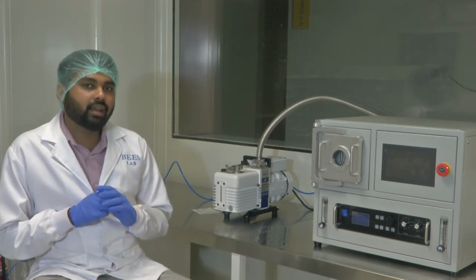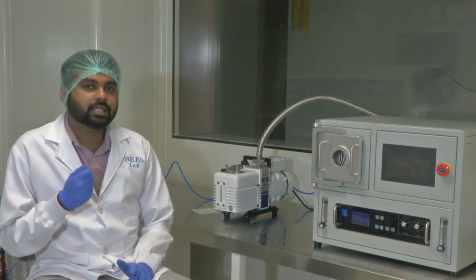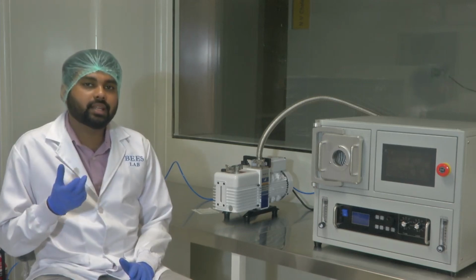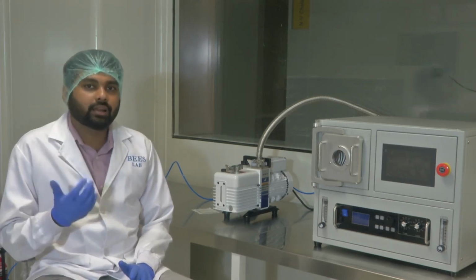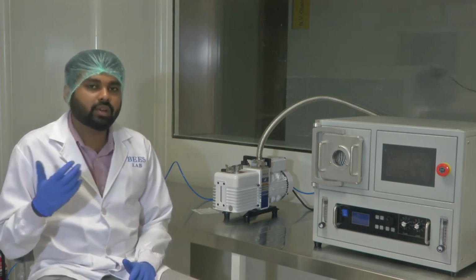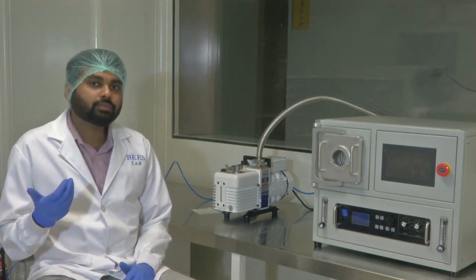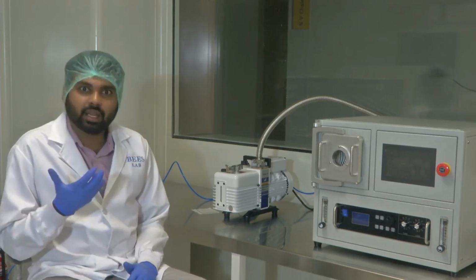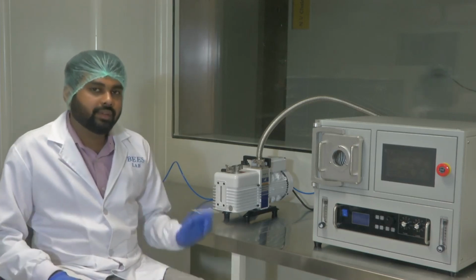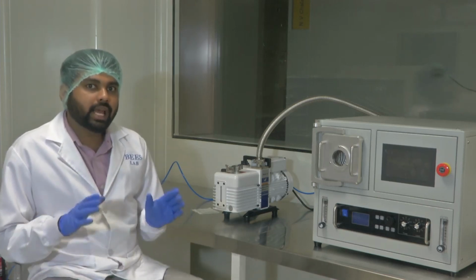Okay. Another thing is, when I talk about plasma, the biggest thing that comes to the mind of anybody who has studied science till at least class 10th or 12th is the color. So plasma has a unique color for different properties. Let's say argon plasma, oxygen plasma. If you make plasma out of different entities, they will have specific colors. Oxygen plasma has a kind of pink color. We will be creating plasma here today. It will be very interesting for you to watch. We will see the process and all. So the plasma has a unique color.